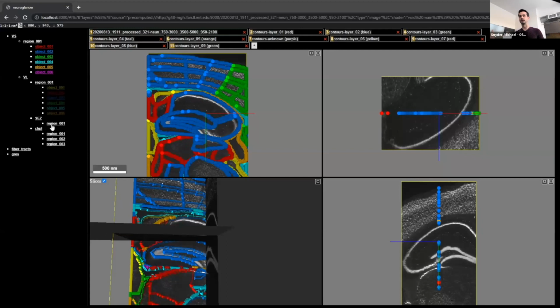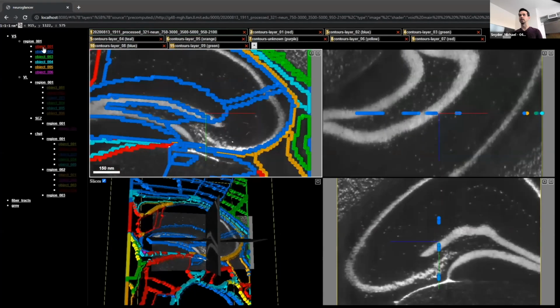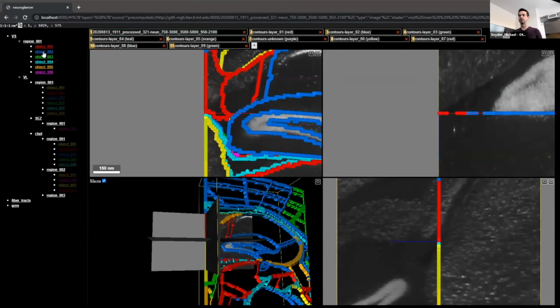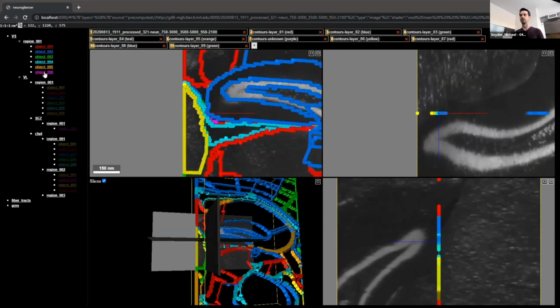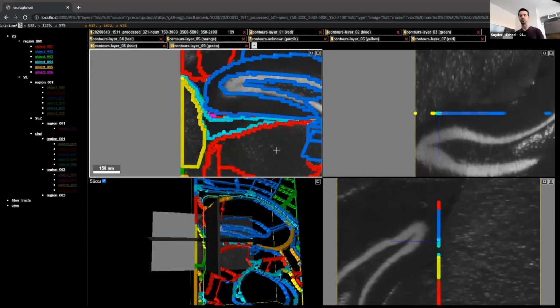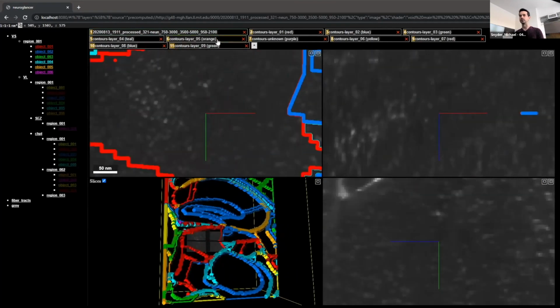And so all of this data is being pulled from our backend JSON data store that Lars was talking about. And as the user navigates through it, if they choose to add new annotations or adjust any of the ones that are there, it'll all automatically be saved in real time so that if they reload later, all of their changes have been preserved.